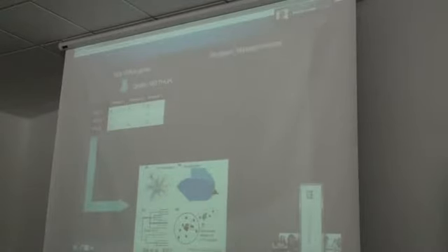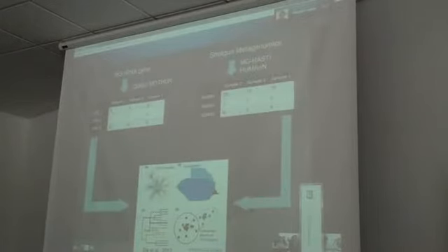And then the other approach is shotgun metagenomics. So shotgun metagenomics is where you would take data and fragment all the different genomes. You would sequence hopefully most of the fragments, and you come up with information not just about who was there, but also what they're doing. And then to annotate those reads, you would run something like, say, MG-RAST, or HUMAnN, or SmashCommunity, or there's actually quite a few packages out there, all with advantages and disadvantages.